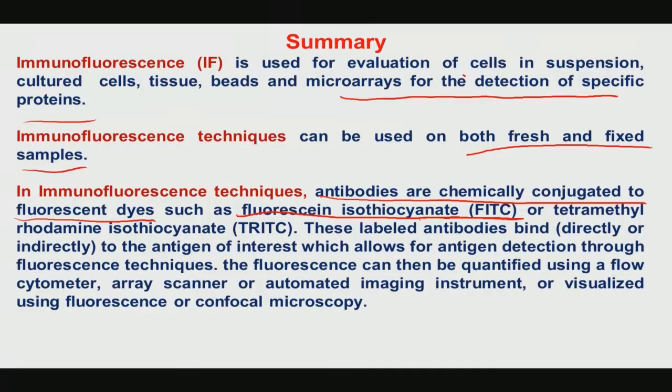And another thing mentioned in this summary slide is that after these antibodies are appropriately labeled, they bind to the antigen of interest, which allows for antigen detection through fluorescence techniques.